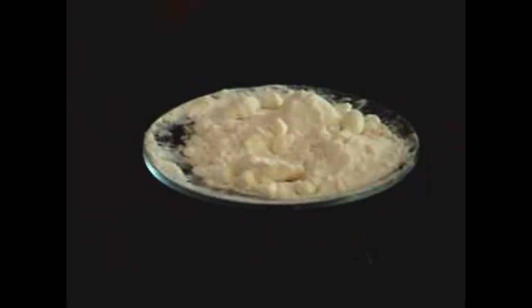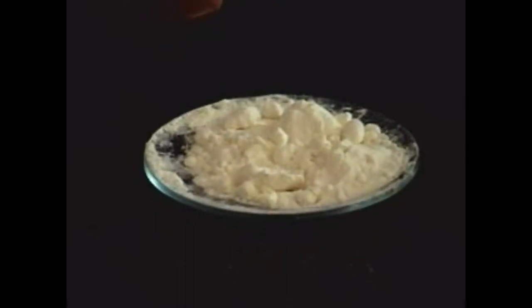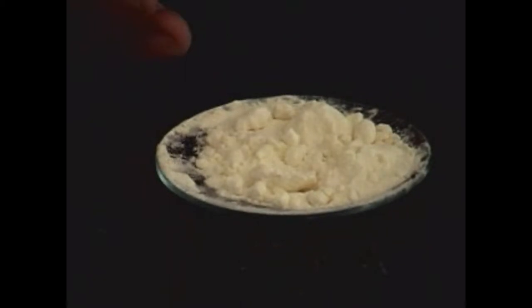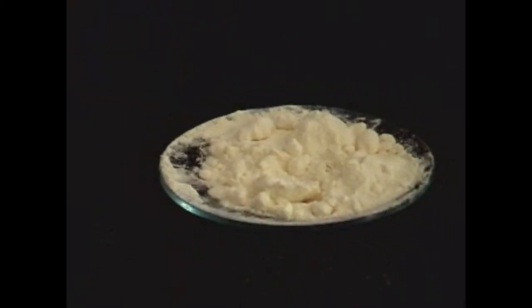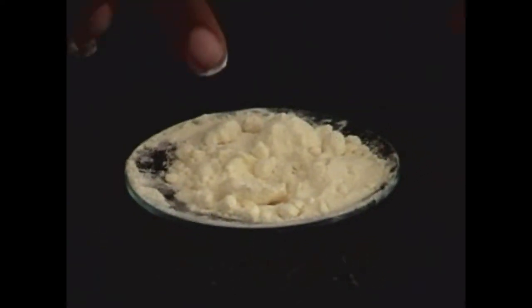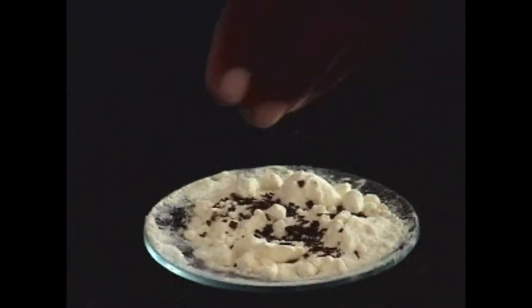Mixtures can be separated by using physical methods. In this activity, we are using a magnet which can attract magnetic material. The mixture we are going to take is the combination of sulphur and iron. So now let us mix these two.